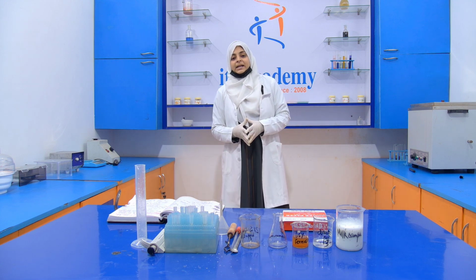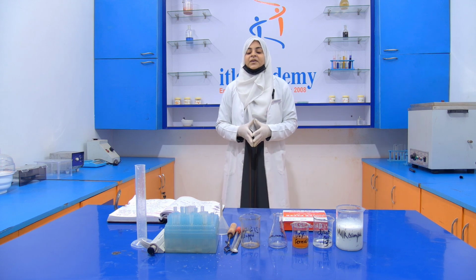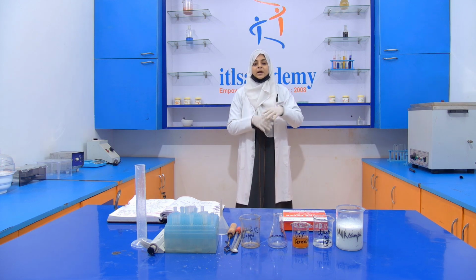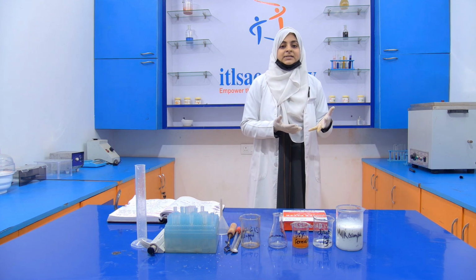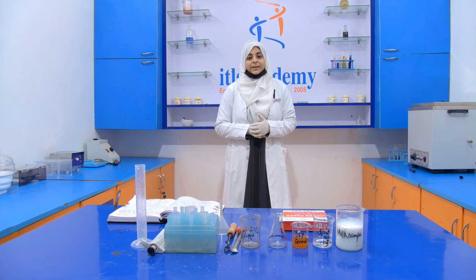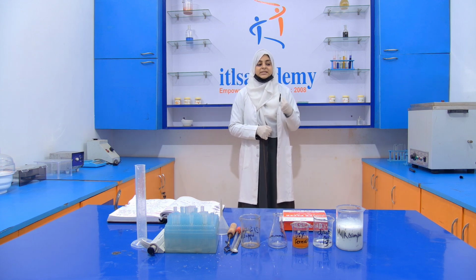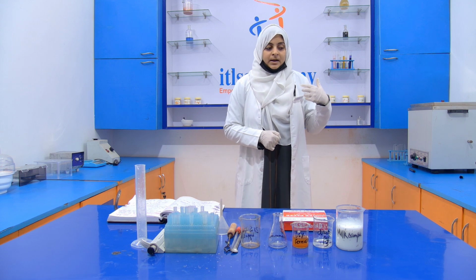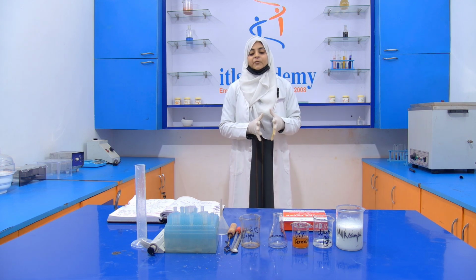Now, when we are handling concentrated HCl, we have to take extra care and extra precaution. We have to wear proper gloves, a proper mask and a proper lab coat, so that the concentrated HCl does not come in direct contact with our skin. Otherwise, it will damage our skin, be absorbed by our skin, and cause irritation. Concentrated HCl can also damage our eyes, so we have to avoid it.